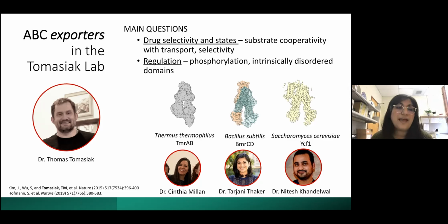And so I am happy to call myself out as a former crystallographer. Tom, myself, and Cynthia all have a background in biochemistry and crystallography, and Nitesh was our yeast biologist on board. And so together, we put our heads together and were able to successfully determine not one, but two cryo-EM structures of BmrCD and YCF1 to better understand how drug selectivity is dictated by structure, as well as how regulation drives ABC transporter function.